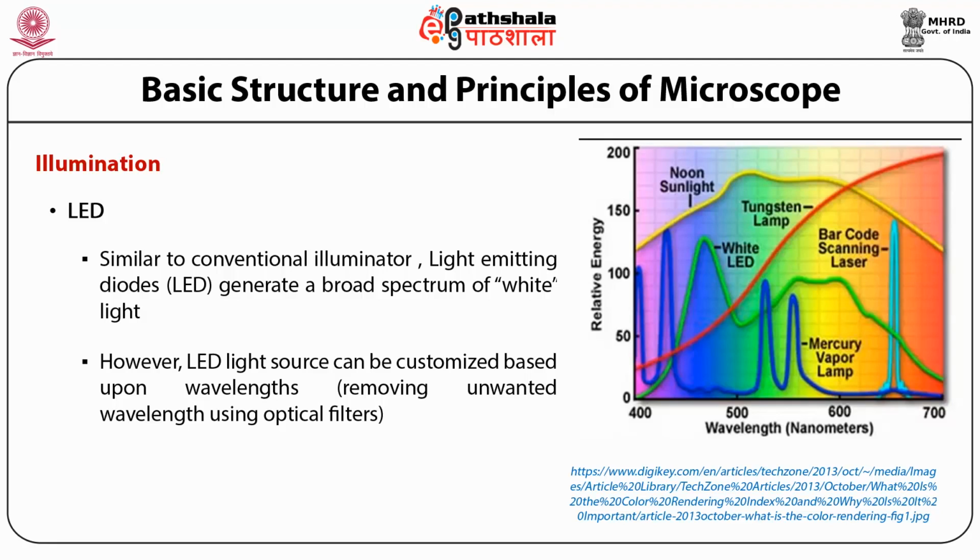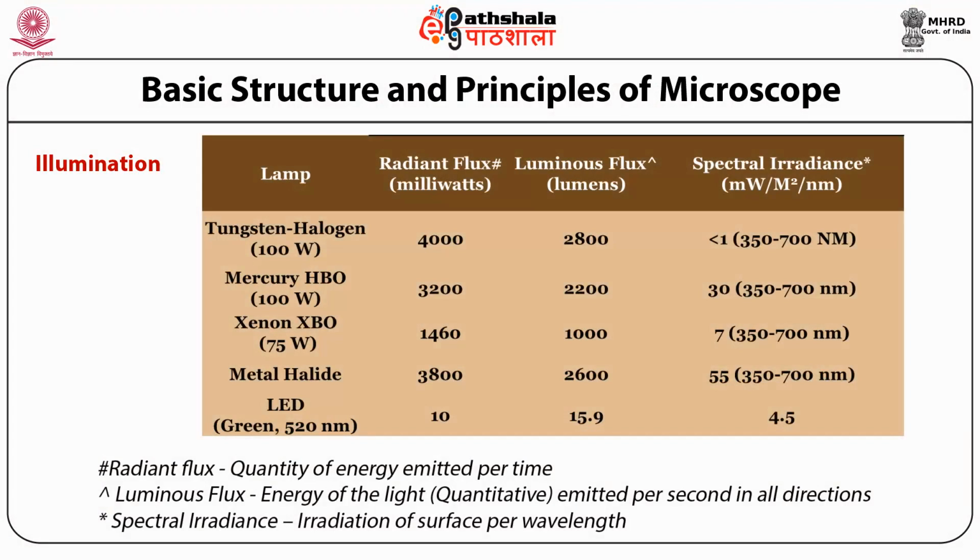White LED light, on the other hand, will have more or less relatively the same energy except higher at the 488 region, that is the green region. Apart from that, it has a very similar profile in terms of energy. And the noon light, the sunlight, will have a uniform distribution of all these wavelengths with relatively similar energy. Therefore LED provides a very good, highly reproducible light source.